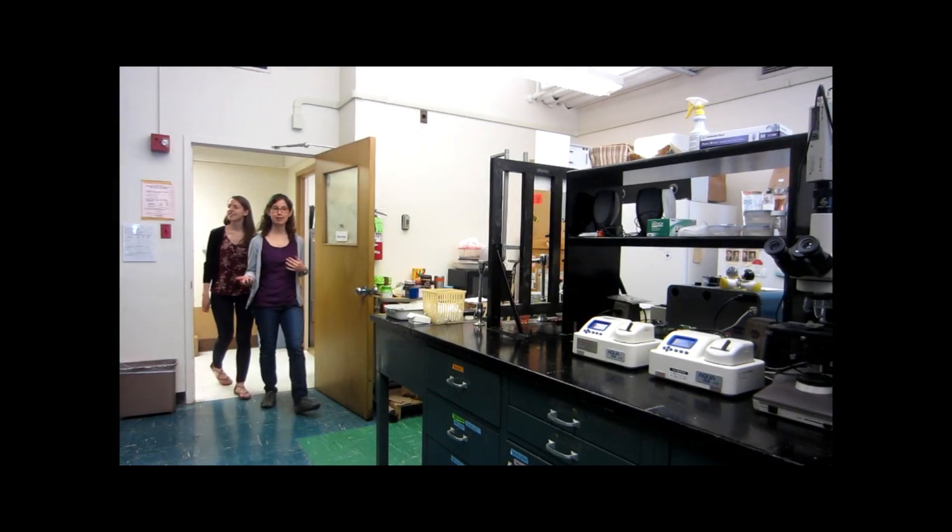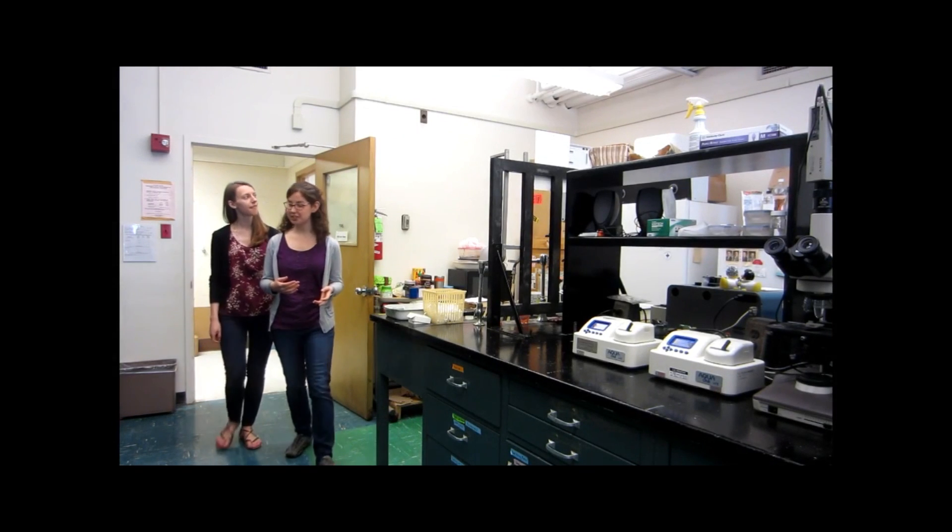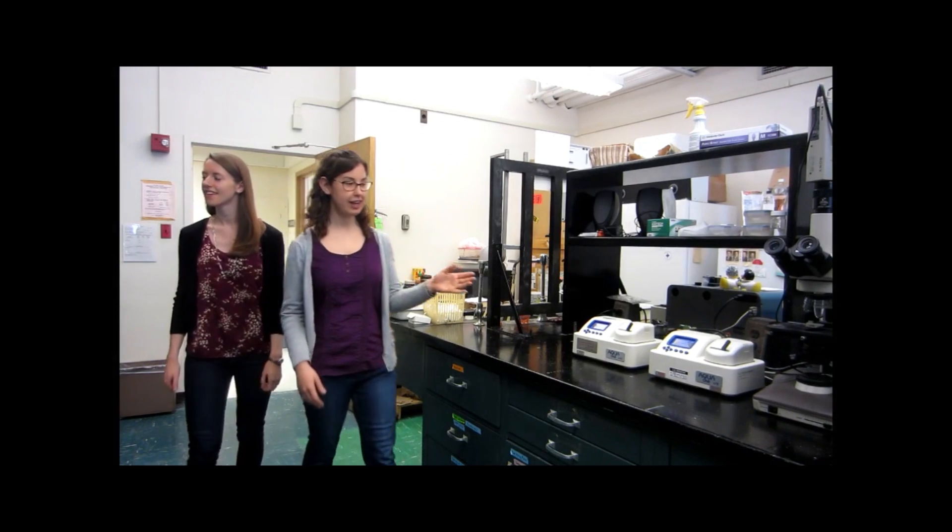So this is the lab where you'll be spending most of your time doing research. As you can see here, we have two water activity meters. Water activity? I never learned about that.